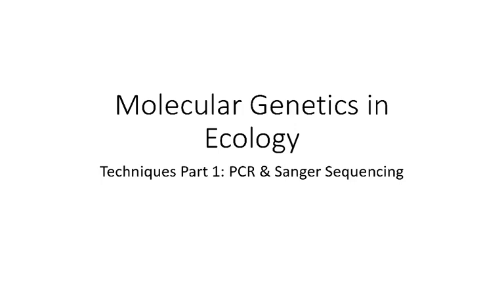So far in this module, we've talked about different characteristics of DNA and different types of genomes. And for the next part of this module, starting in this video, we're going to dive a little bit deeper and talk about different techniques or methods that are used in molecular ecology studies. And we'll start with the techniques of PCR and Sanger sequencing in this video.